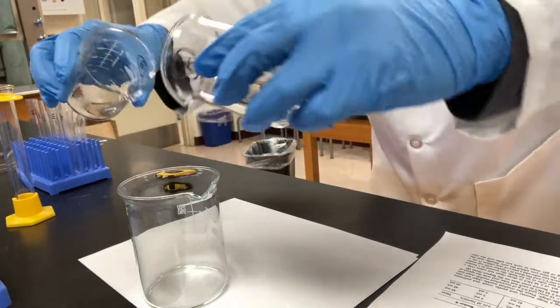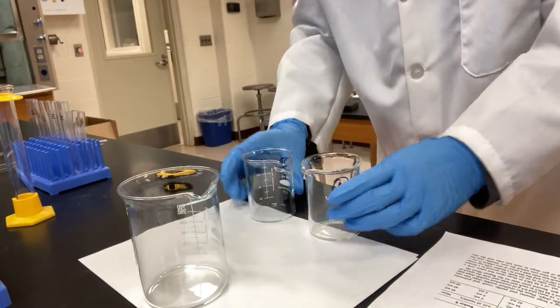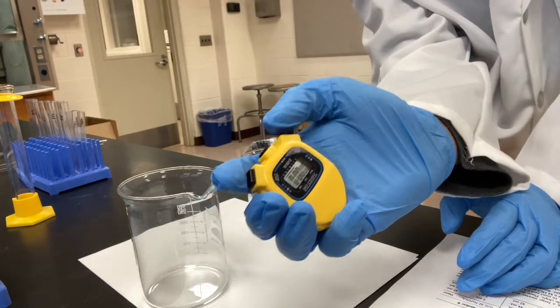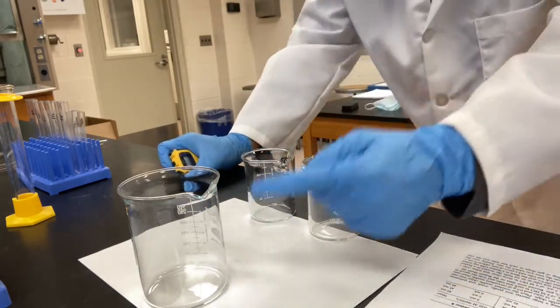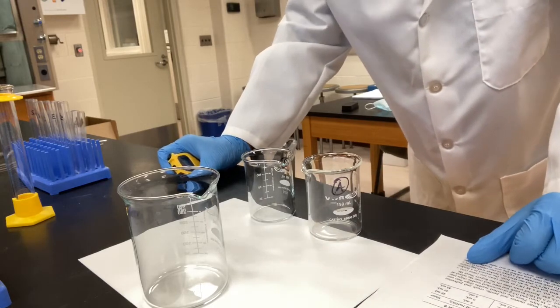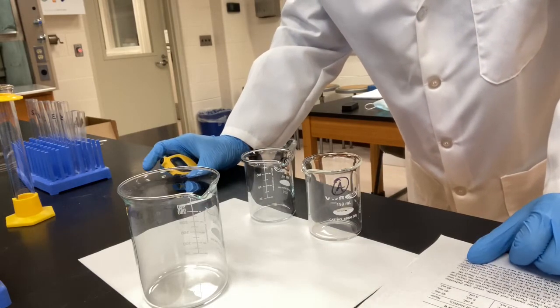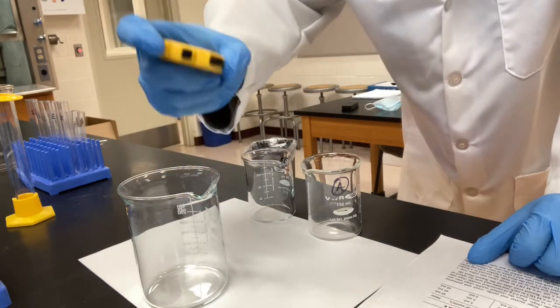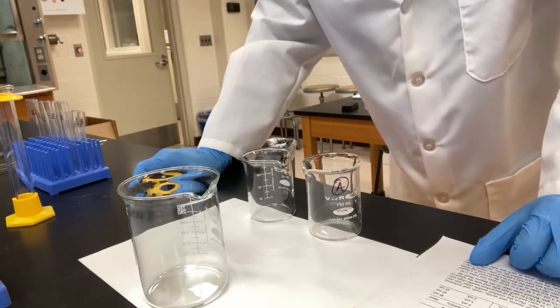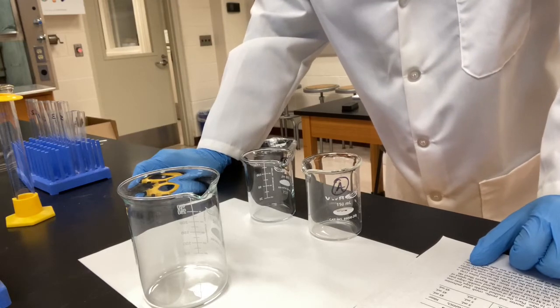We're going to pour them into a 3rd beaker. Right after that, I'm going to start my stopwatch and watch the solution. Wait for the blue color to appear. Once it appears, I'm going to stop the stopwatch and record the time it took.